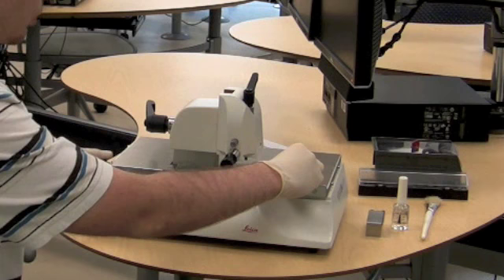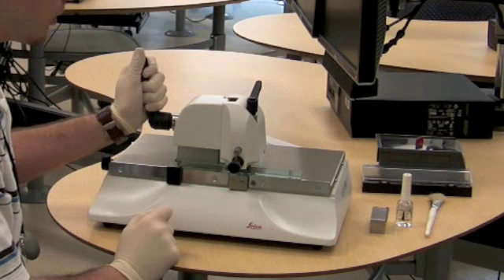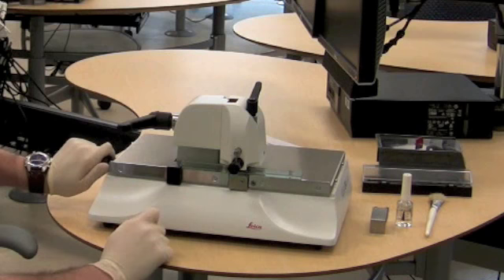We're going to turn the rotatable knob to lock it into place. We're going to make sure that the scoring shaft is pushed back into the instrument. And then we're going to slowly lower the clamping lever down again to lock this piece of glass into place. We'll turn the rotatable knob back again to make sure that the clamping lever is the only thing holding it.